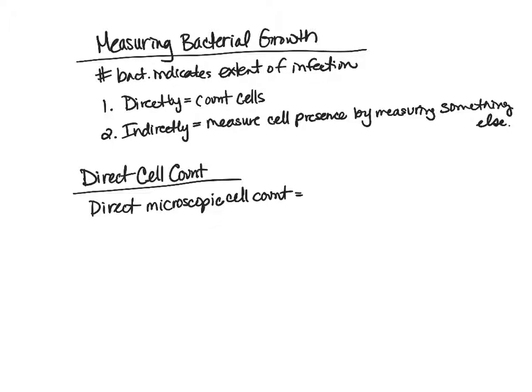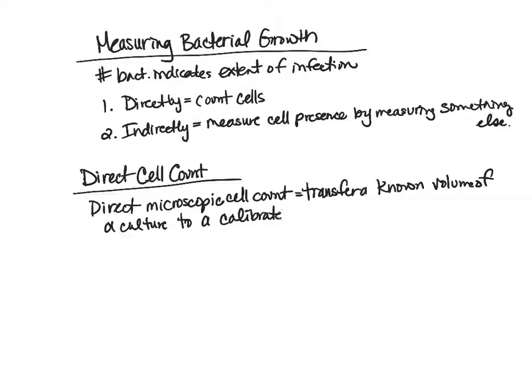And then basically, as its name implies, counting the cells under a light microscope. So what we would do is transfer a known volume of a culture to a calibrated slide. Some of the other terms that were used are a counting slide or a Petroff-Hausser slide, or chamber, not slide, sorry.